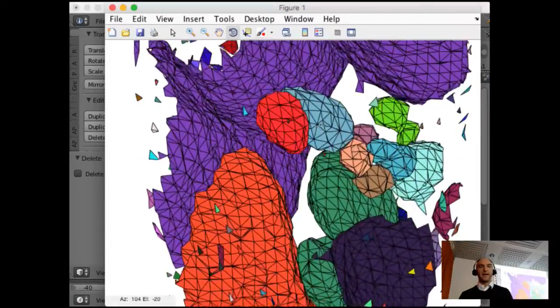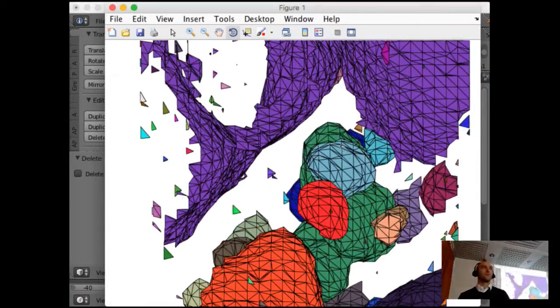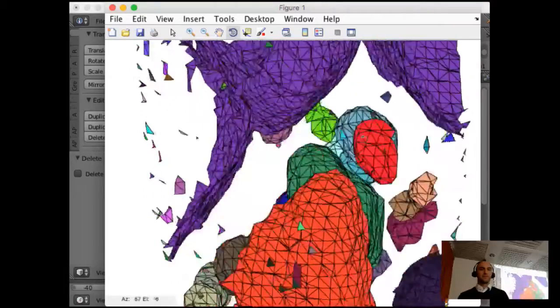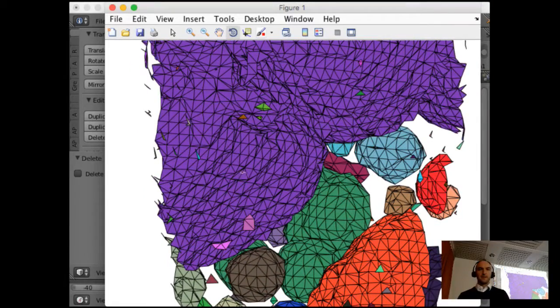But for now, I'd actually prefer we work with the raw algorithm and then later add some other stuff on top, just so you can see what the effects are of different smoothing algorithms. Because there's always the danger that you over smooth things, and in the end, your data is not really 100% representative of what you measured anymore. And you really, really need to understand the algorithms that you use for your analysis.